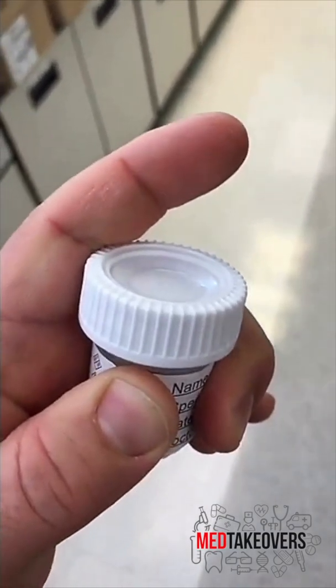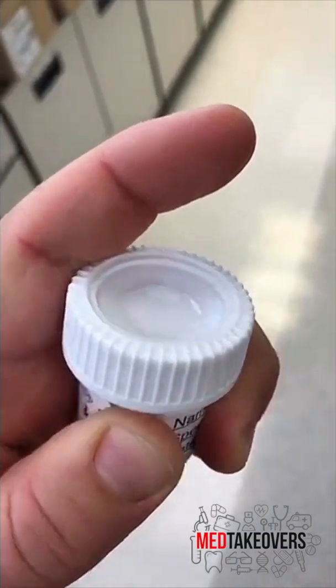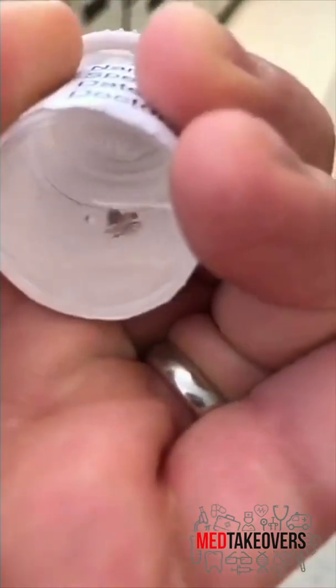So you go to your dermatologist and they cut an abnormal mole off of you. They put it into this little jar filled with formaldehyde — formalin.